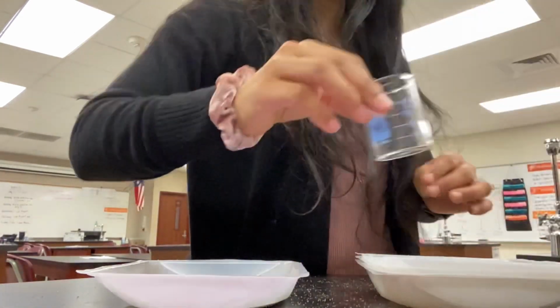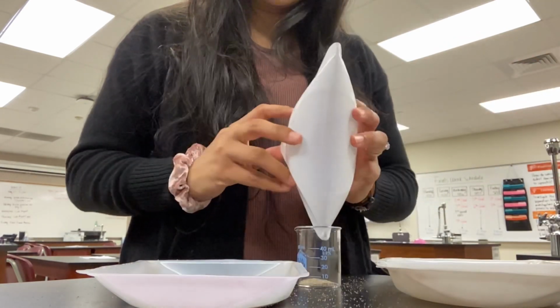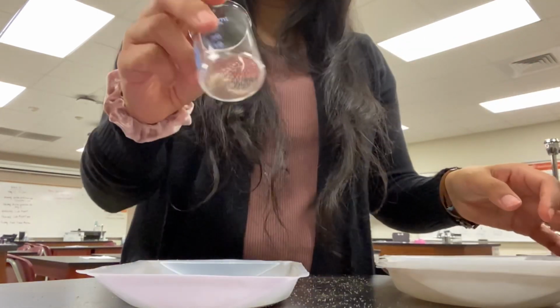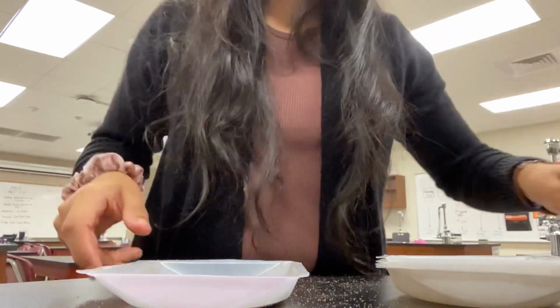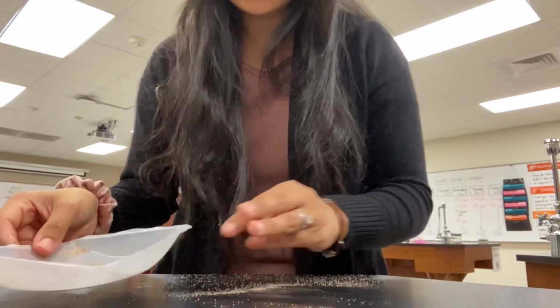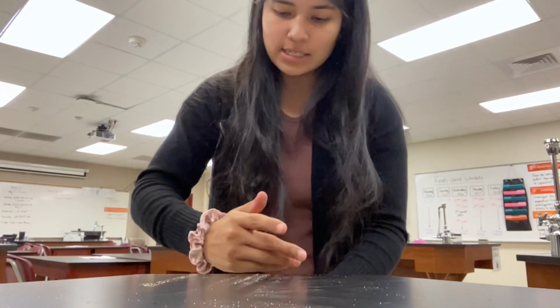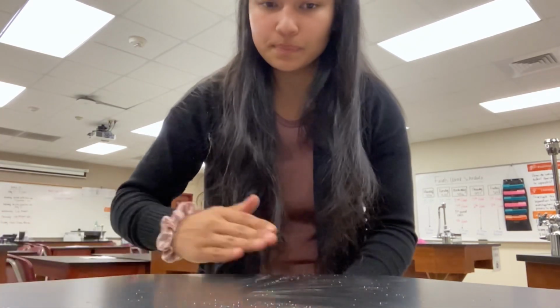So I will take all of my pepper from this container and place it in here. This is what we have. All right, so then what is left in here, whoa, just dropped some of our sample, no. What is left in here is going to be the sand and our ionic compound.